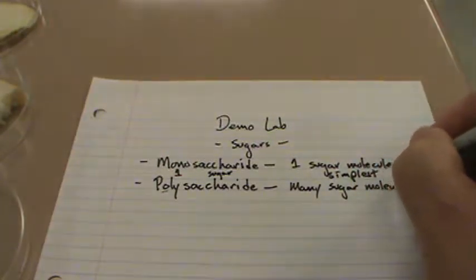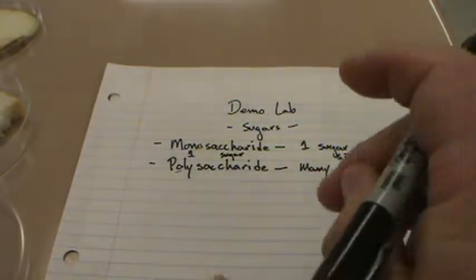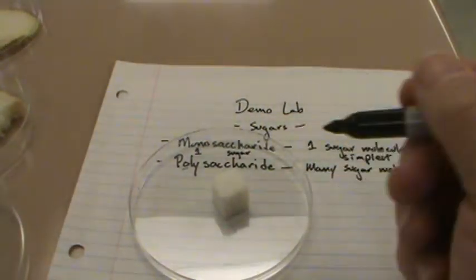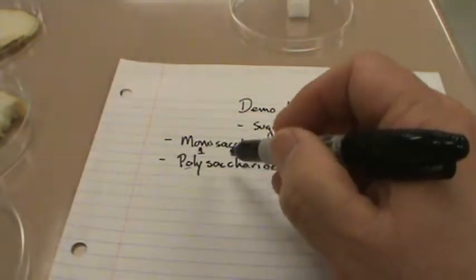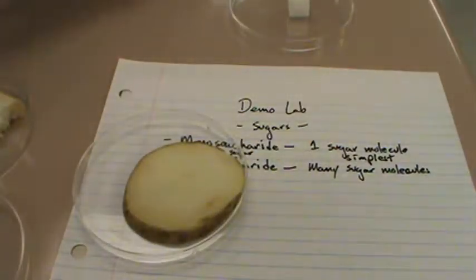Why is this important? It's because different sugars do different things. For example, single sugar molecules become what we call sucrose. In this case, this is a sugar cube right here. More complex polysaccharides become the starches that we know in a potato. And here it is. I cut this one right out of a potato. There's the potato it came out of. Got that at my local supermarket the other night.